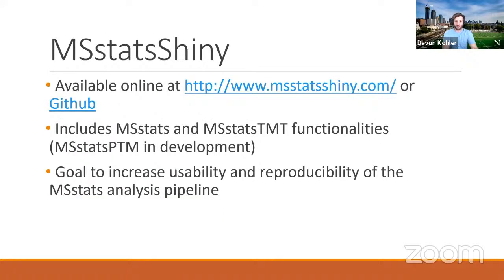Okay, so those are the main MSstats packages. There's also MSstatsLOBD. I didn't go over it here. Like I said, it's not really integrated in the main workflow, but it's available on Bioconductor if you'd like to use it. Next, I'll go over MSstatsShiny, which we obviously did a lot of work with yesterday, but just to give you an idea of the reason it was developed and when you might actually use it versus some of the code functionalities and when it might be appropriate.